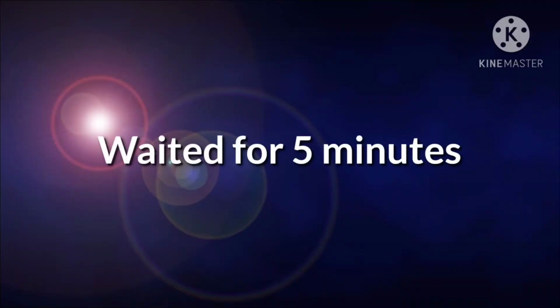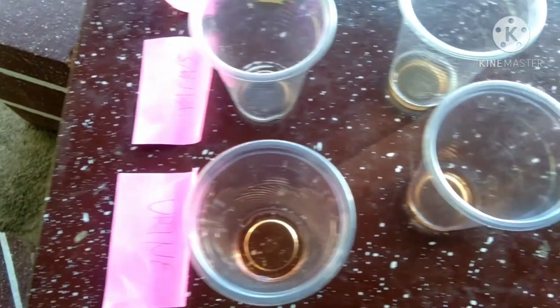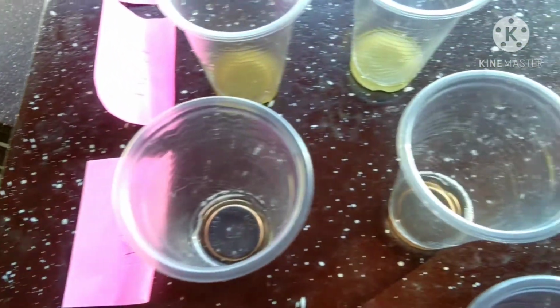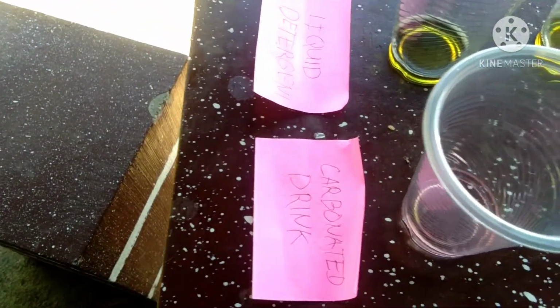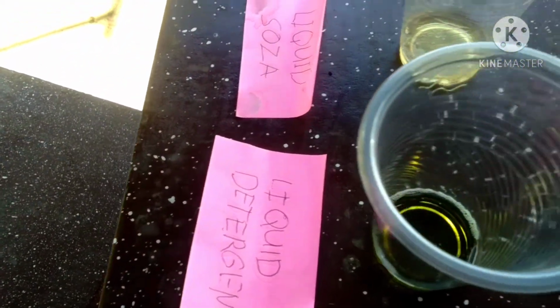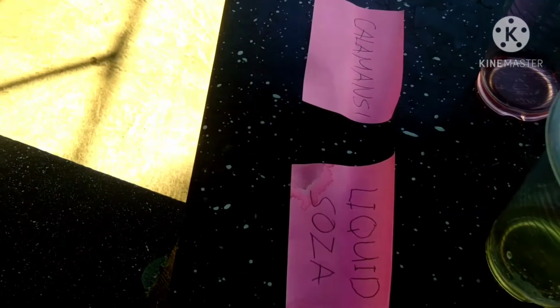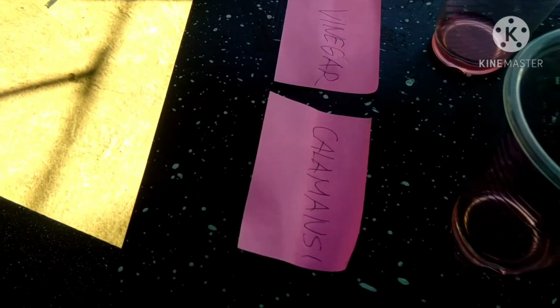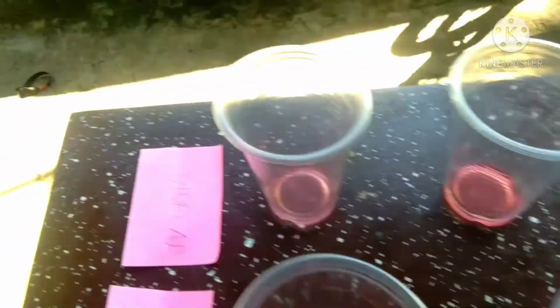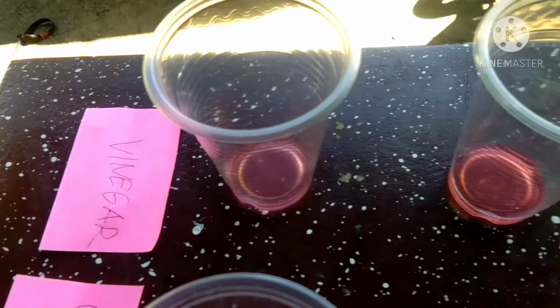So I waited for 5 minutes to see the final result. The urine, they both become red. The saliva, they both become yellow. Alum, they both become yellow. Carbonated drink, they both become red. Liquid detergent, they both become yellow-green. Liquid soda, they both become yellow. Calamansi, they both become red. Vinegar, they both become red.